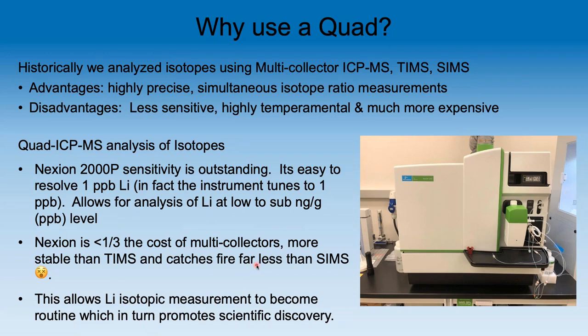And I write here, it catches fire far less than a SIMS does. If you've never worked on a SIMS, I went into Carnegie Institution of Washington and their motherboard had melted down, and they were like, oh yeah, don't worry, we got another one on hand just for those kinds of occasions. I don't have to worry about that on my quad. This is a very stable, very solid instrument that allows lithium isotopic measurements to become routine, which is exactly what we want.